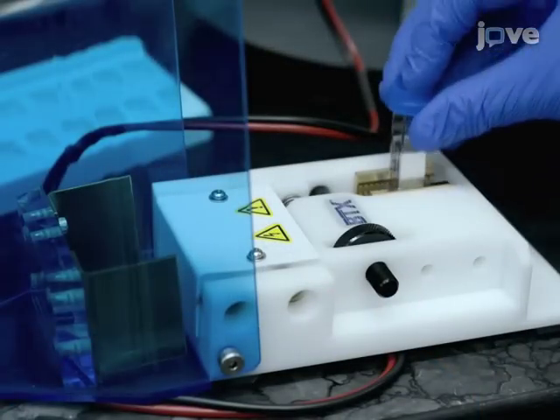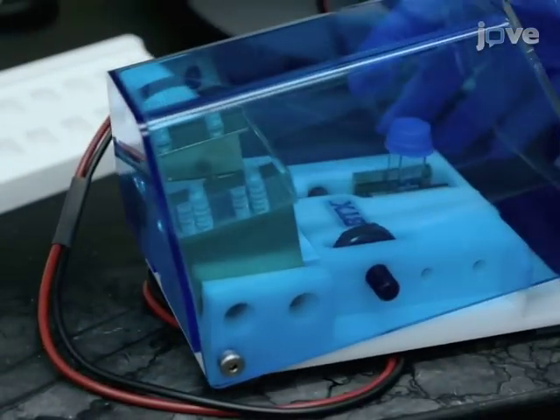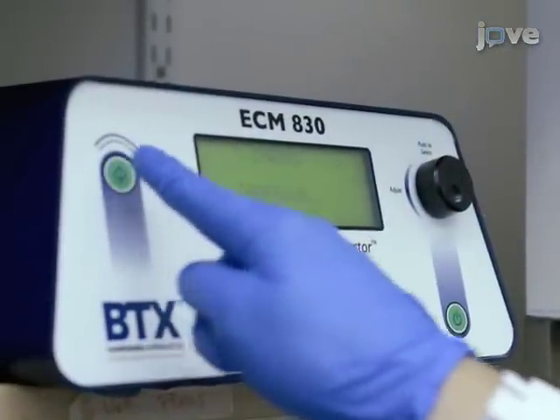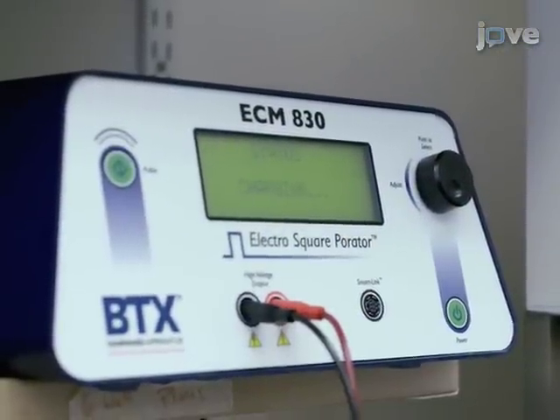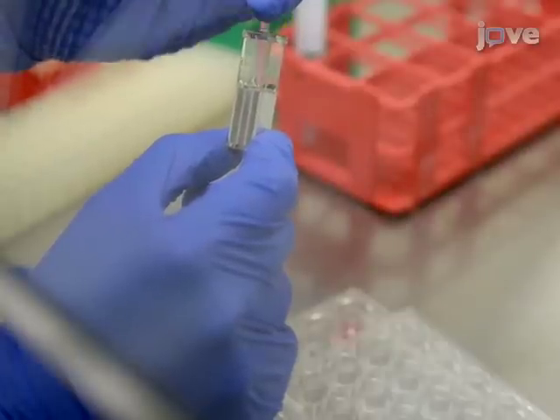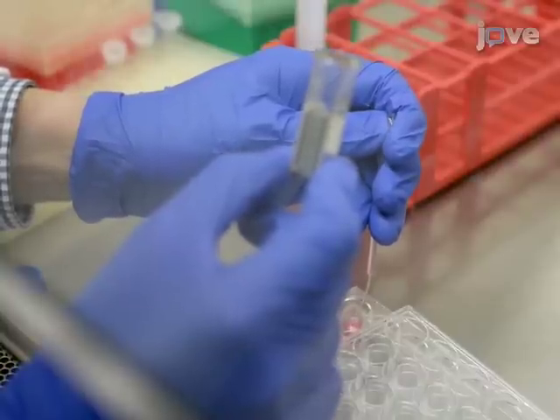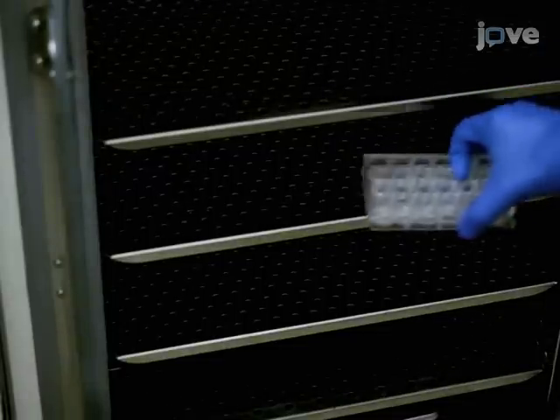Using an electroporation system, electroporate the cells with 250 volts for five milliseconds in a two millimeter cuvette. With a sterile transfer pipette, immediately transfer the solution to one milliliter of pre-warmed culture media. Incubate the cells at 30 degrees Celsius for 24 to 72 hours.